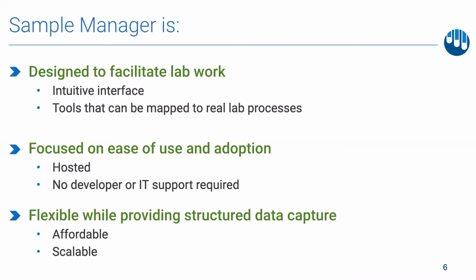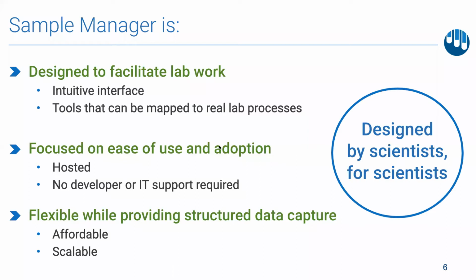Labkey Sample Manager is a cloud-based, built-to-purpose product designed to bring greater efficiency to sample processing while providing a unified view of your samples and data. To make the best product possible that was broadly applicable across scientific disciplines, we created a Sample Manager Product Advisory Council to help guide our decisions. Over a year later, these scientists continue to be highly engaged and provide sincere, valuable feedback about both the current functionality as well as the upcoming features.